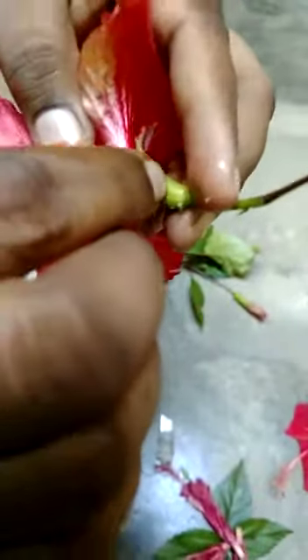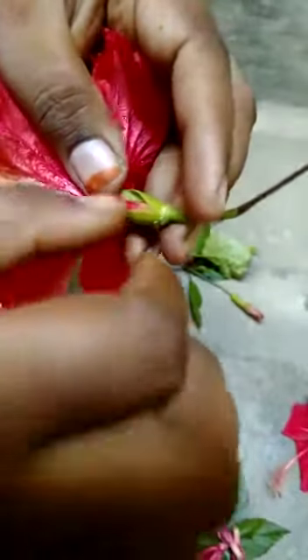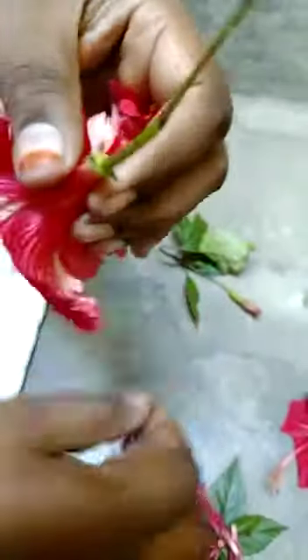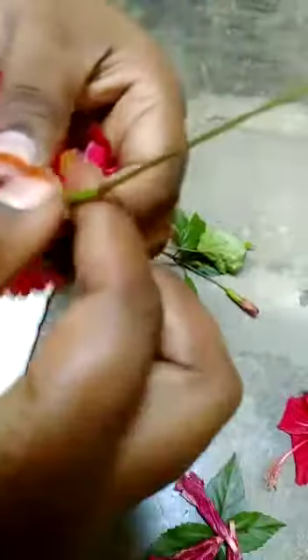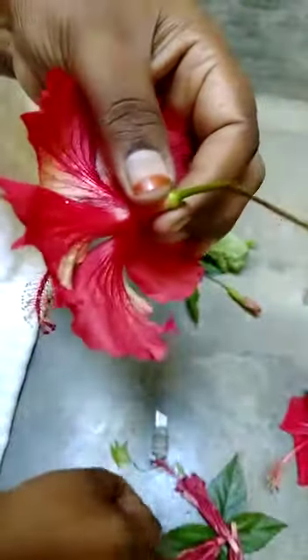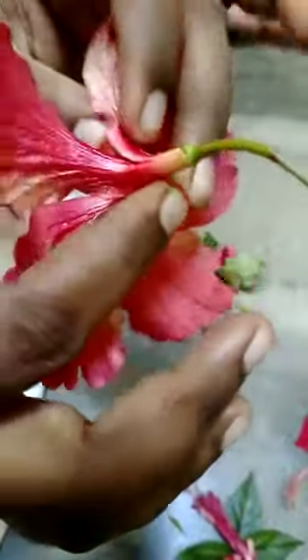First of all, you have to remove the calyx part. Be careful — a small mistake may damage everything. Be careful and be patient while you are doing this. See here, I have removed the calyx part. There is no calyx here, there is no sepal here.